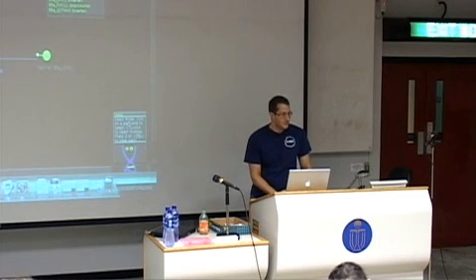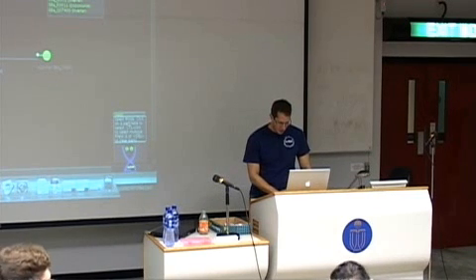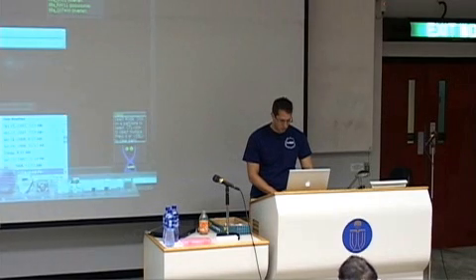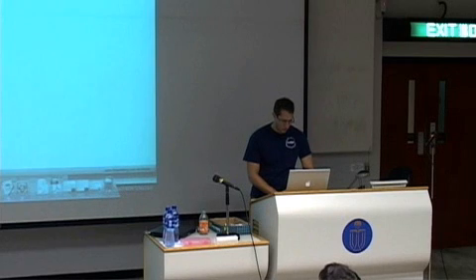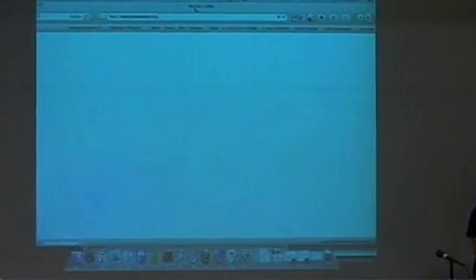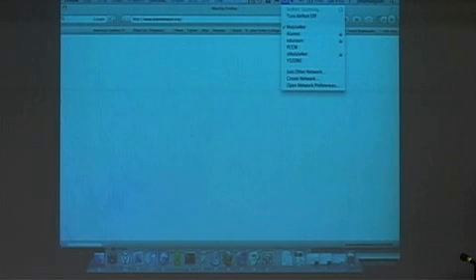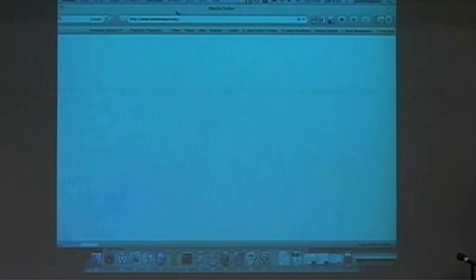Jonathan, can you open the OpenWetWare software tools page? Or computational tools. So I guess we have about 10 minutes, so this is kind of the discussion. What I'm asking Jonathan to do is open the OpenWetWare computational tools page, and this will show folks what's out there. The first thing that comes to mind for me, coming new to the community, is there's a lot of people doing a lot of interesting work, and what we should be doing, in my opinion, is finding ways to make the tools work together and work in complementary ways.